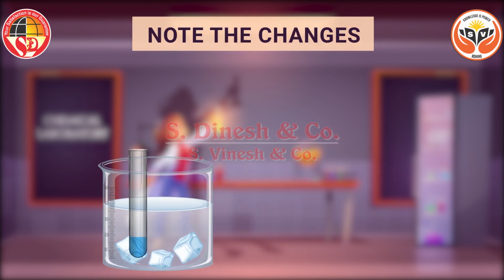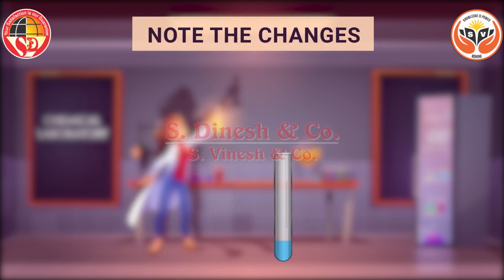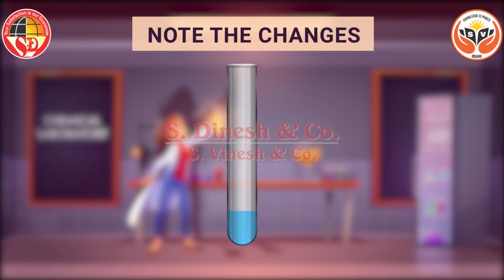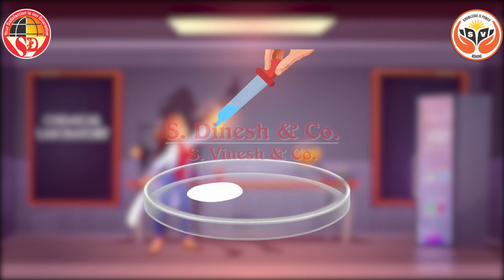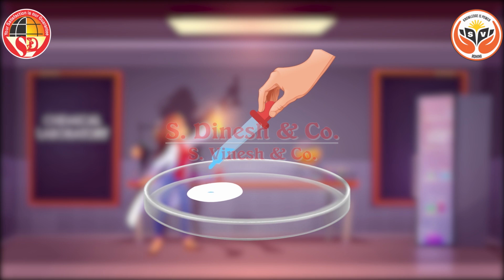Note the color and smell of the liquid collected in the test tube placed in the ice bath. Also, test the acidic or basic nature of the liquid collected with blue and red litmus papers. Add 1 to 2 drops of the liquid to the white powder in the watch glass.